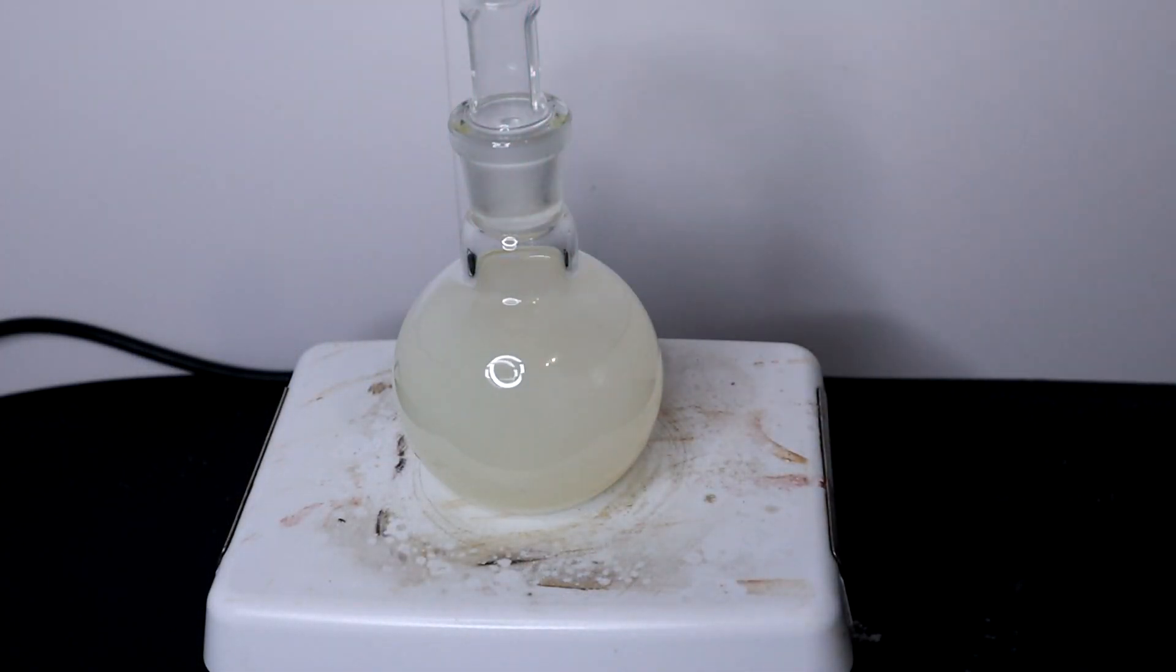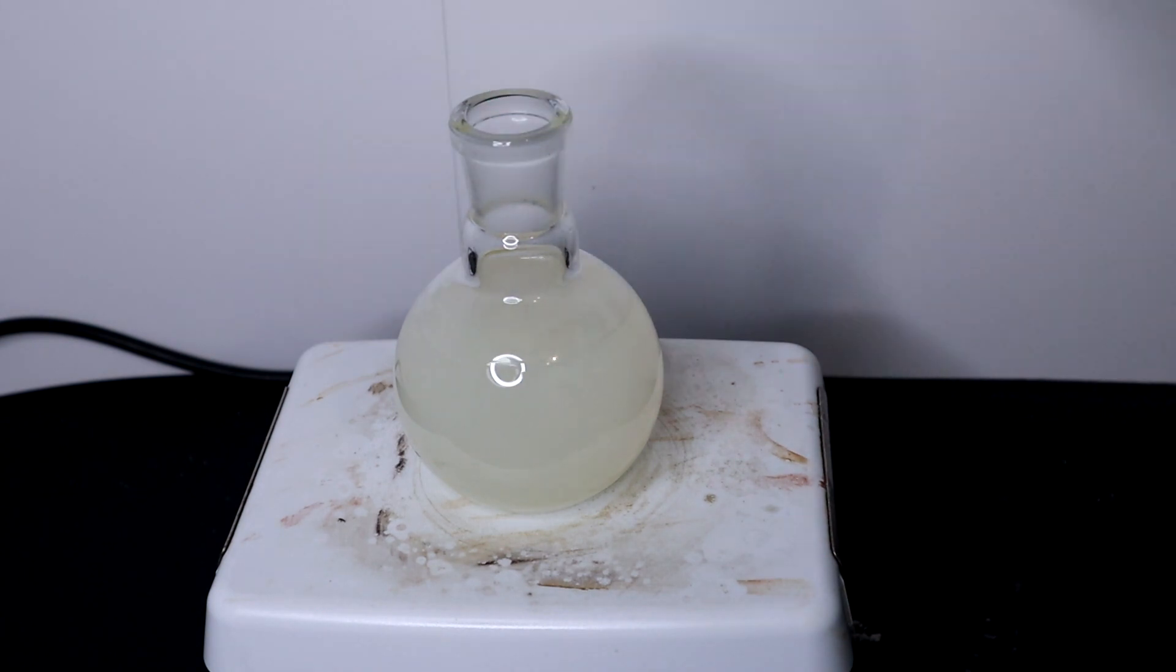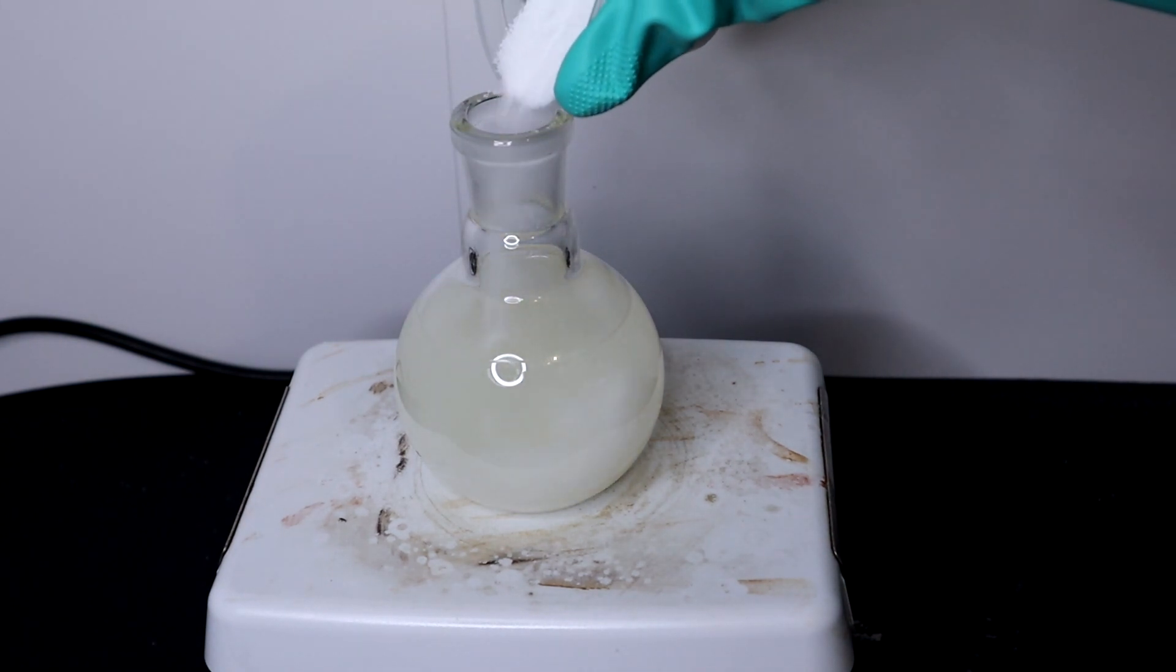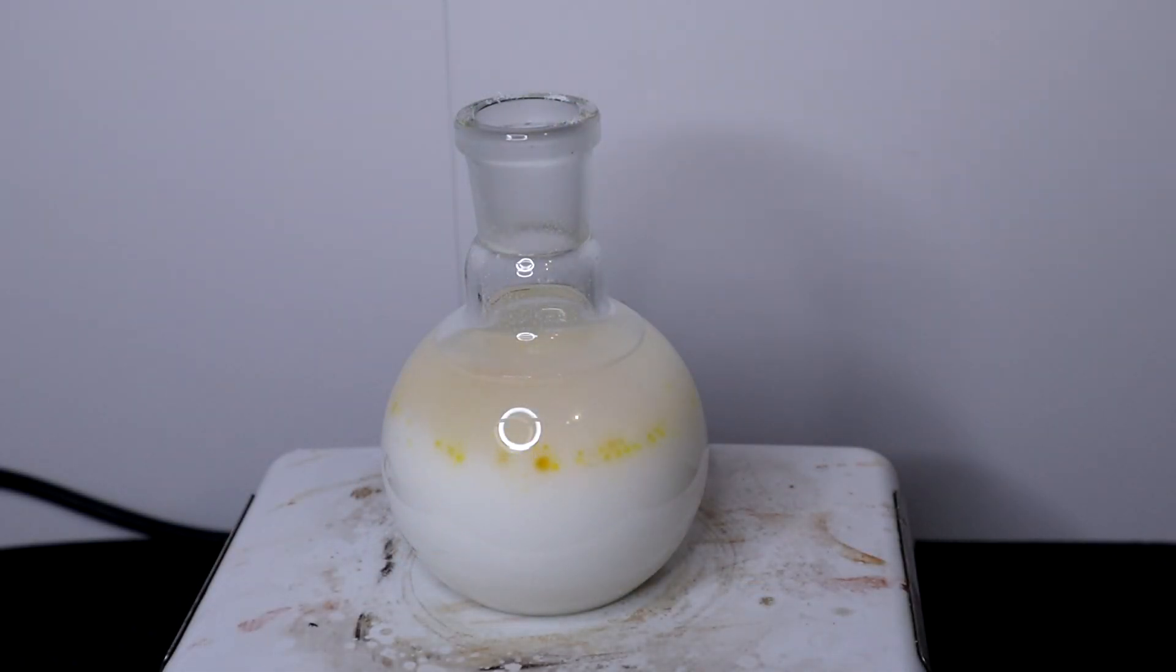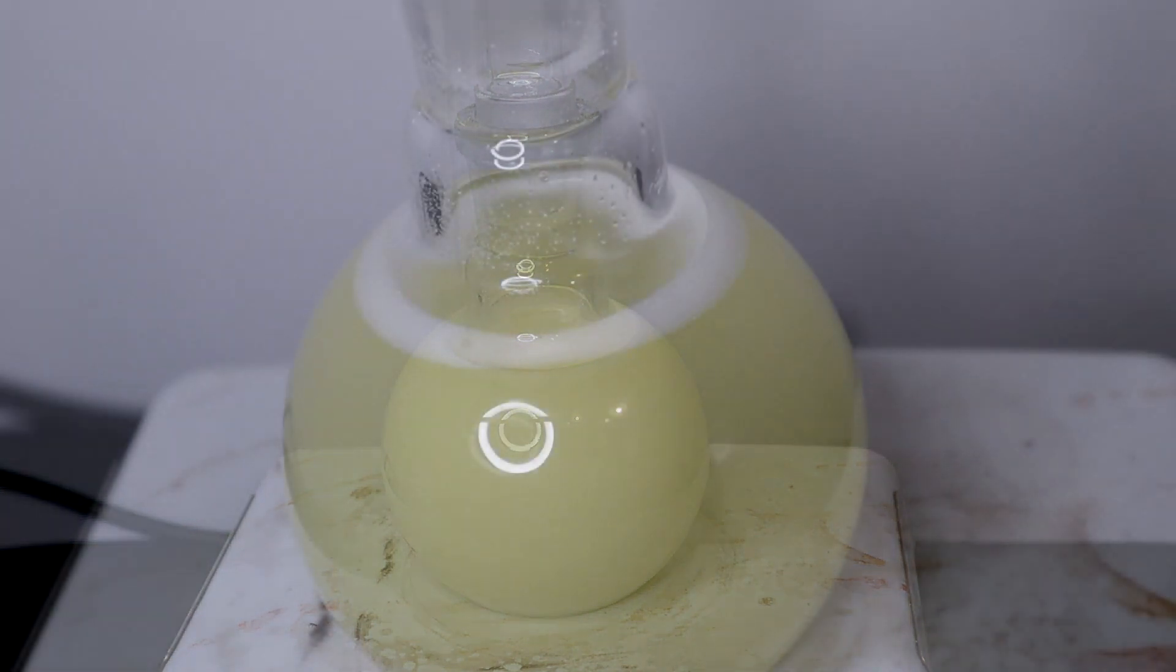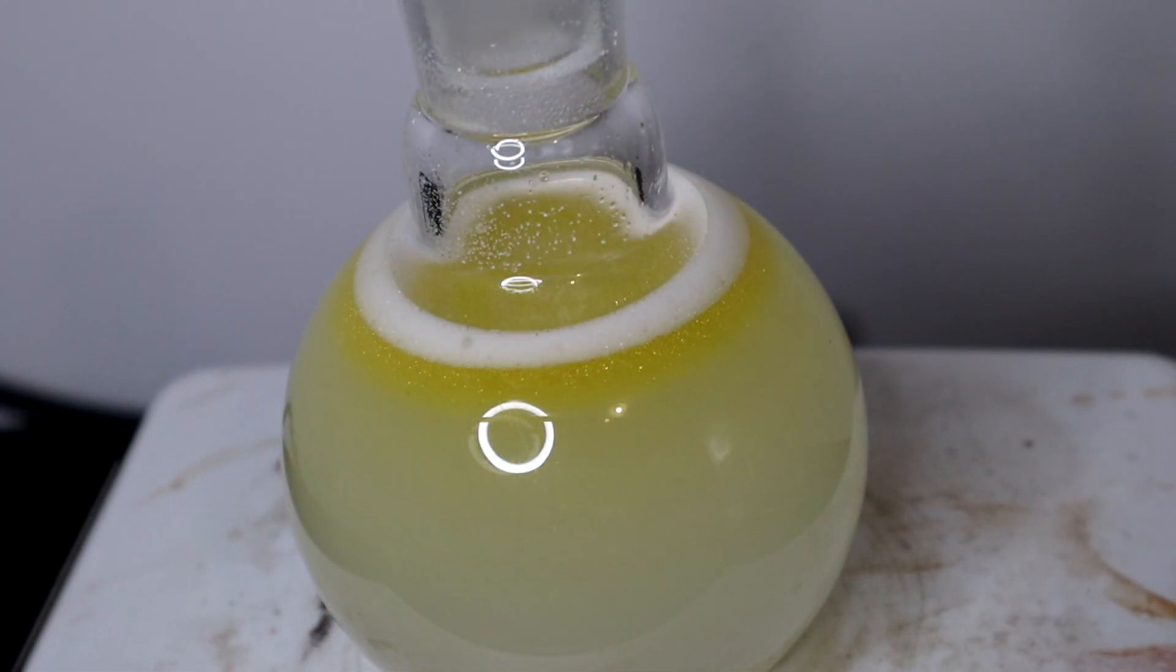As the solution is quite turbid, and just because aniline is slightly soluble in water, I decided to add 60g of salt to the solution in order to decrease the aniline's solubility and hopefully separate the aniline. After stirring, a golden yellow orange layer formed on top.